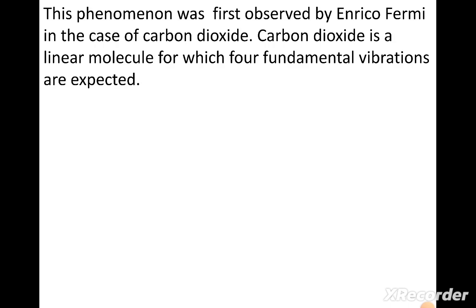Carbon dioxide is a linear molecule for which 4 fundamental vibrations are expected.